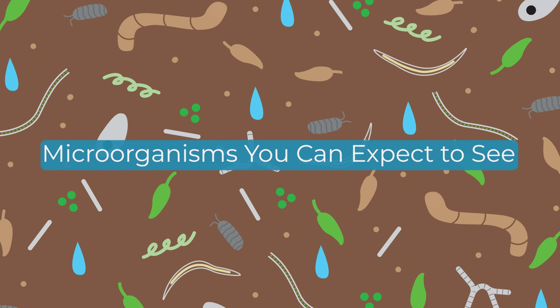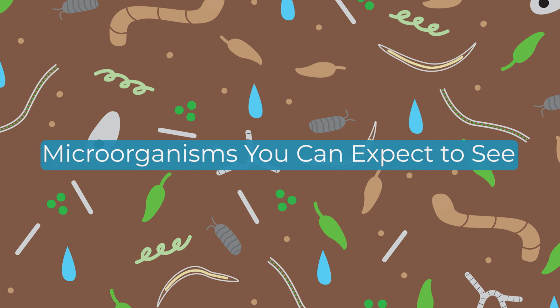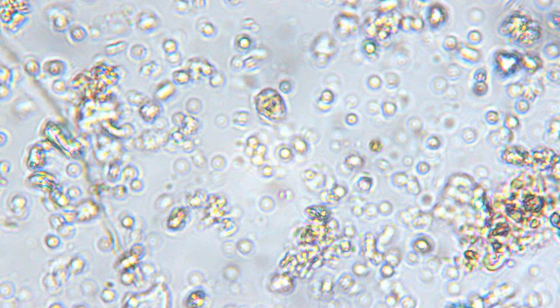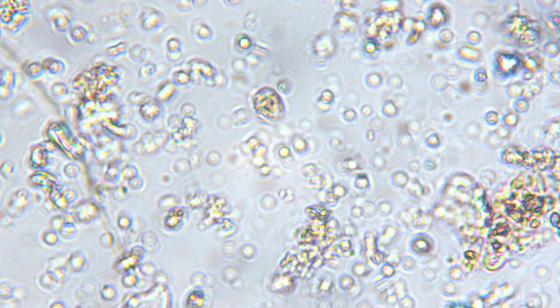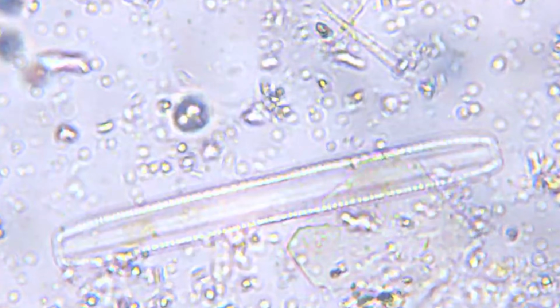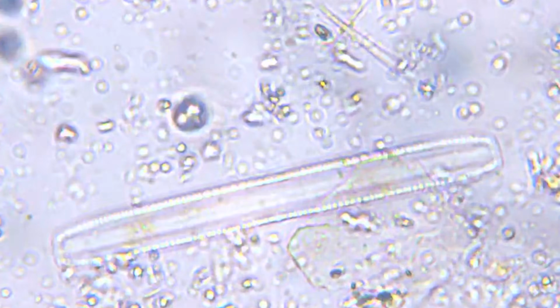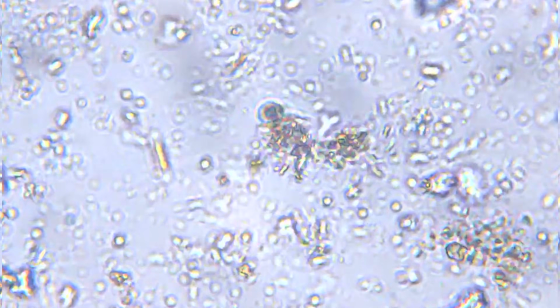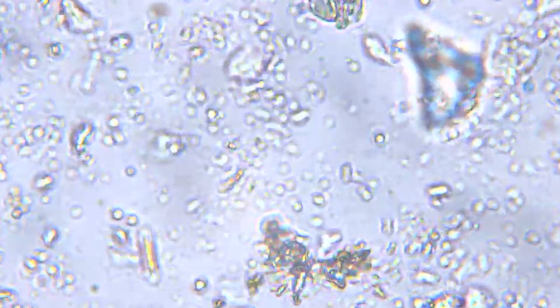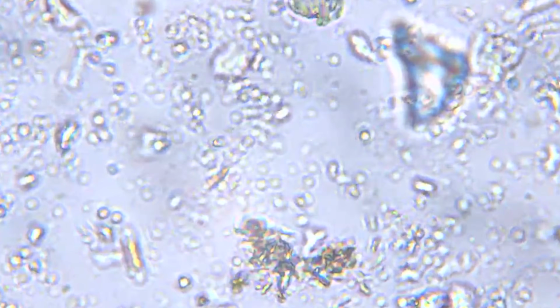Okay, so let's dive deeper into the microorganisms that you can expect to see under the microscope. Bacteria. Among the primary decomposers we mentioned earlier, bacteria are very active in the earlier stages of decomposition. They facilitate the fermentation of food scraps, decomposition of carbohydrates and fatty acids, and suppression of soil pathogens or disease-causing microbes.